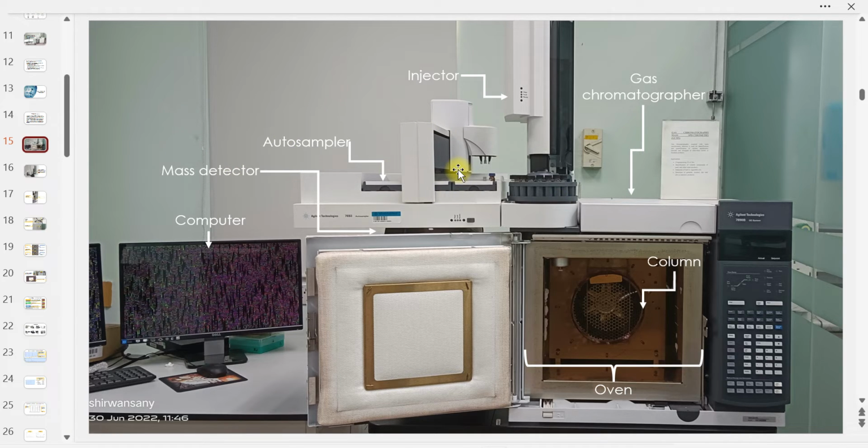But this auto sampler a little bit different from the biotech engineering, the one that we use this morning. Sebab ini dalam bentuk macam square lah. Yang tadi tu inject auto sampler dia in the round punya type. And then at this part ada mass detector, okay, and then you punya computer lah. So this is how your result will be keluar lah, okay. So this is how the GC TOF MS looks like.